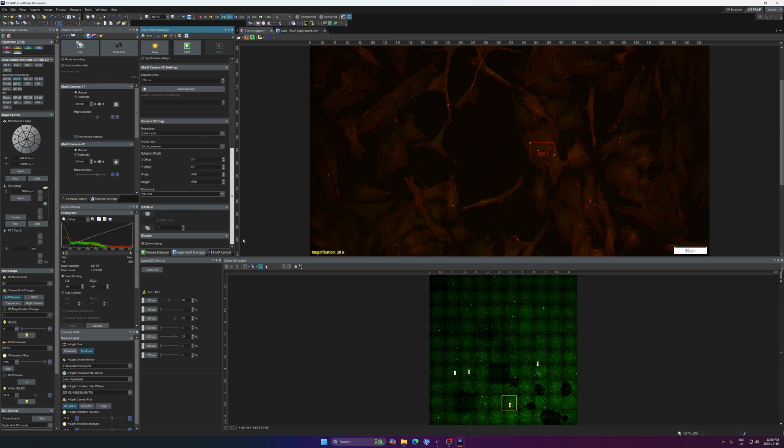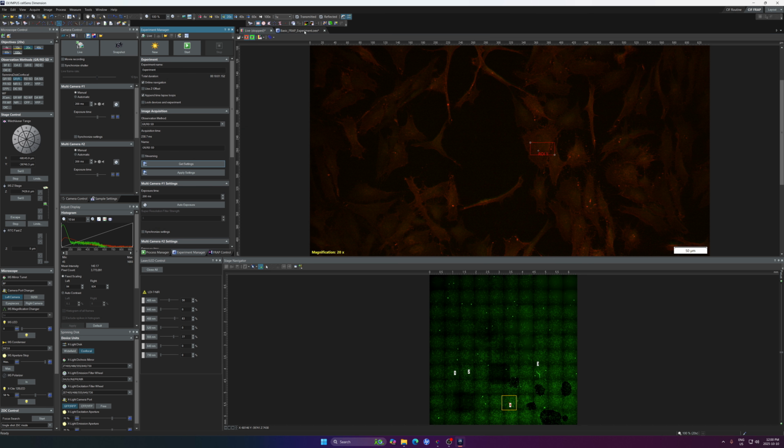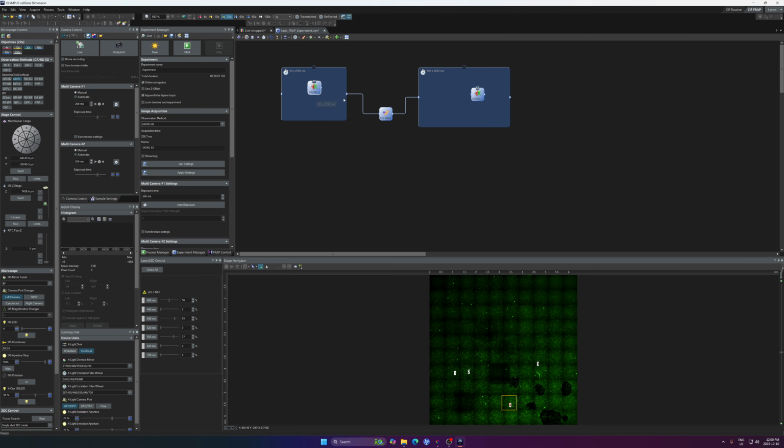and we are ready. But I still like to go back to here a little bit, and let's say I don't want to do 20 images before. You can still set this. I will do 5 frames before, and this will get updated. And the interval, this gets changed, and that's possible. That's okay. I will just do that. Total loop duration, that's the 13 seconds, 14 seconds, right?